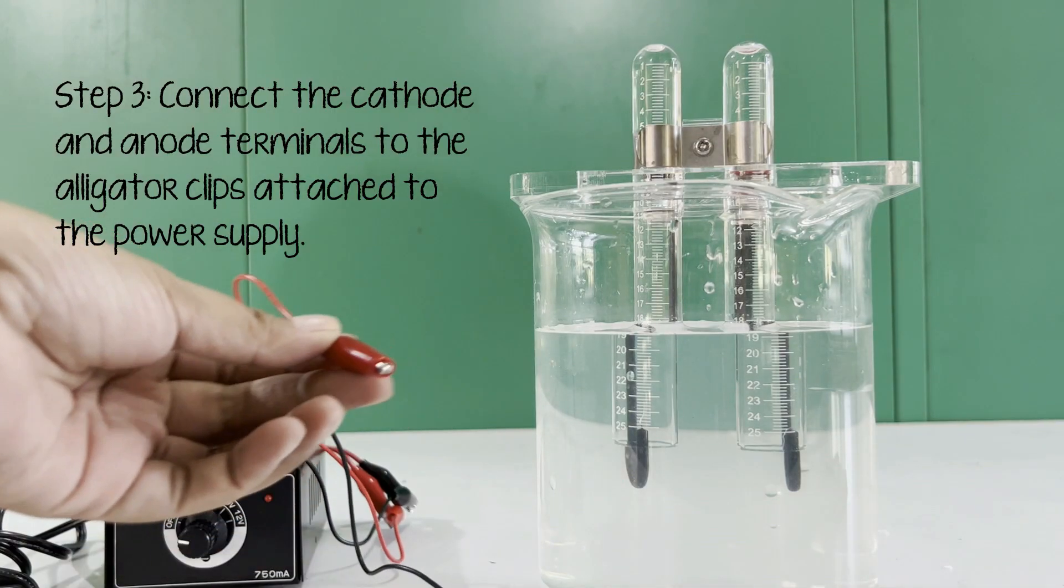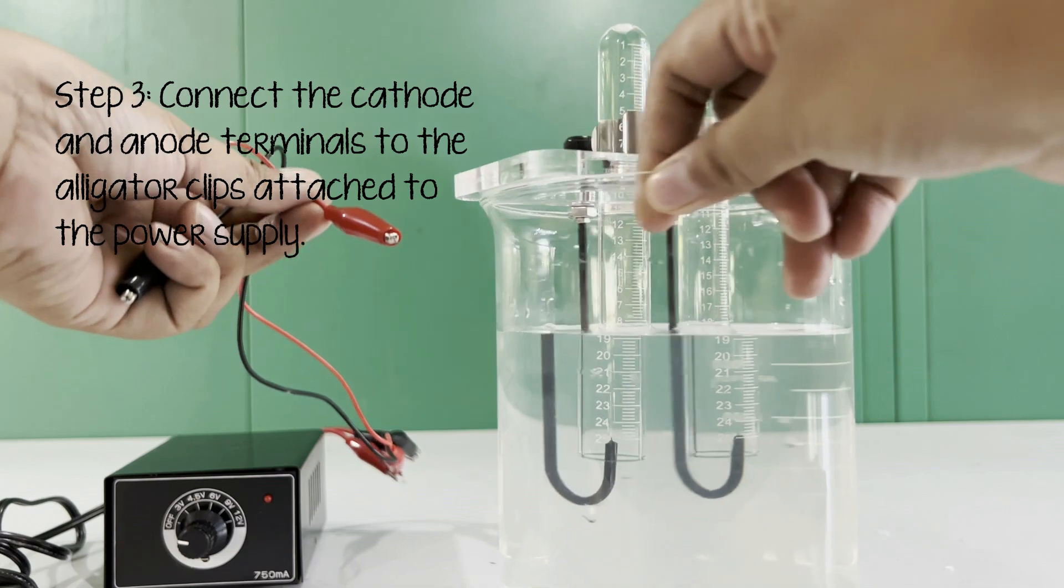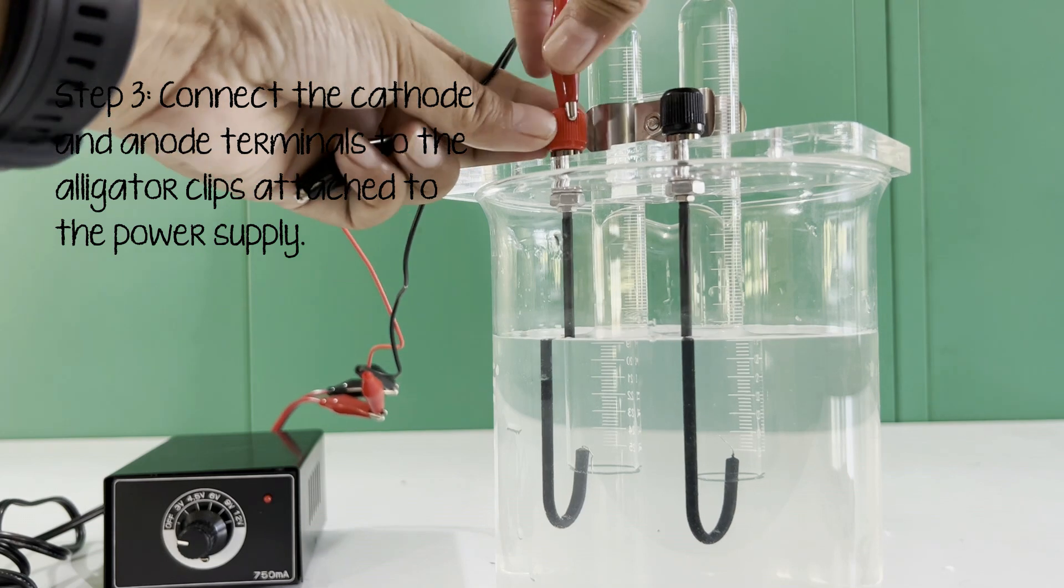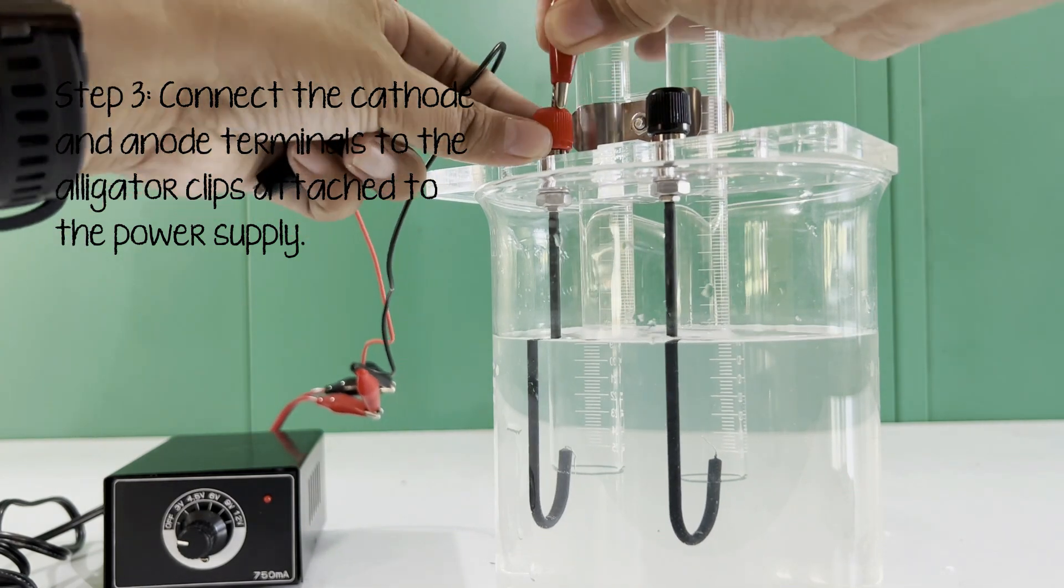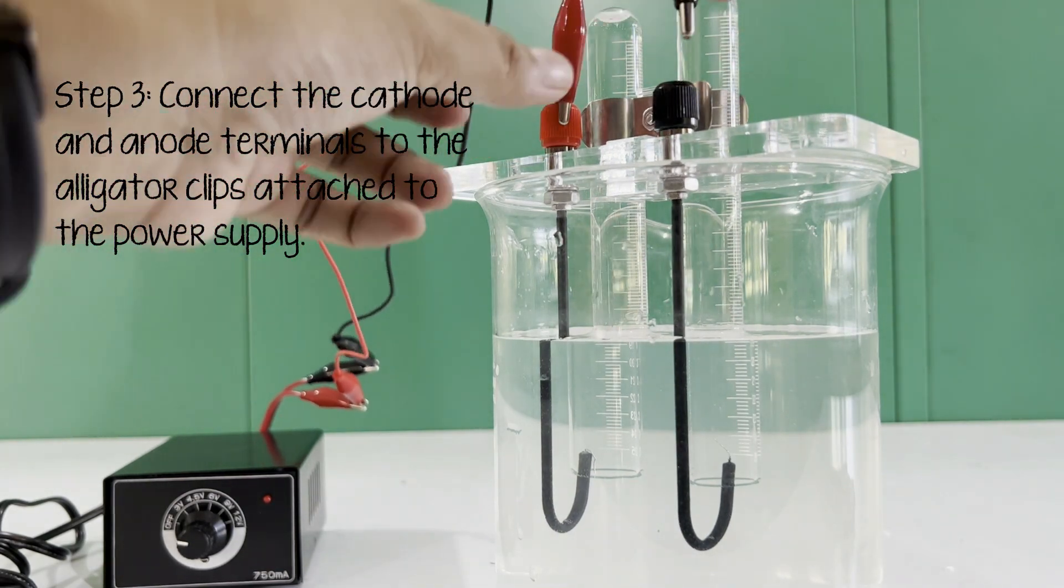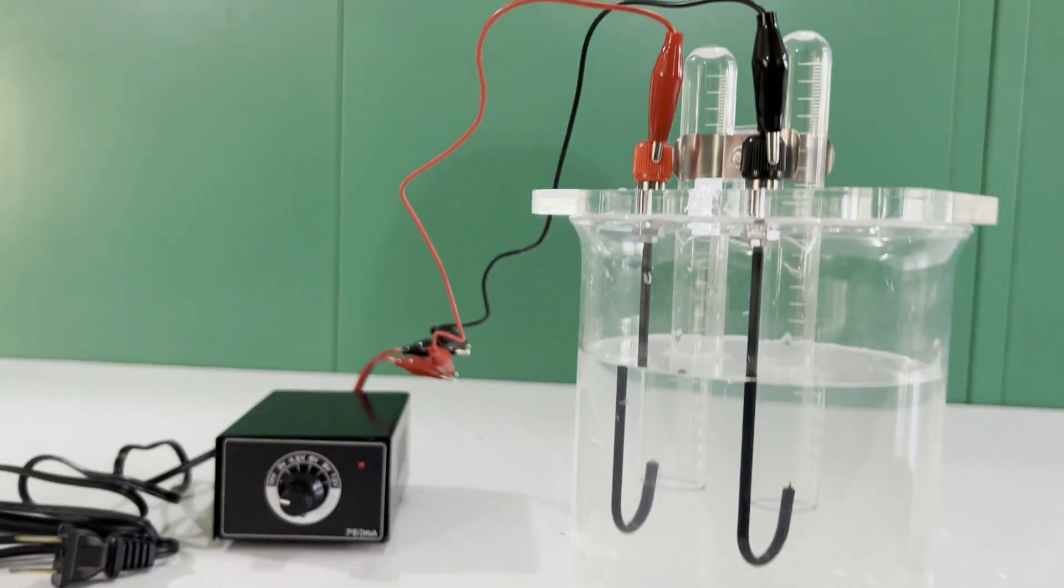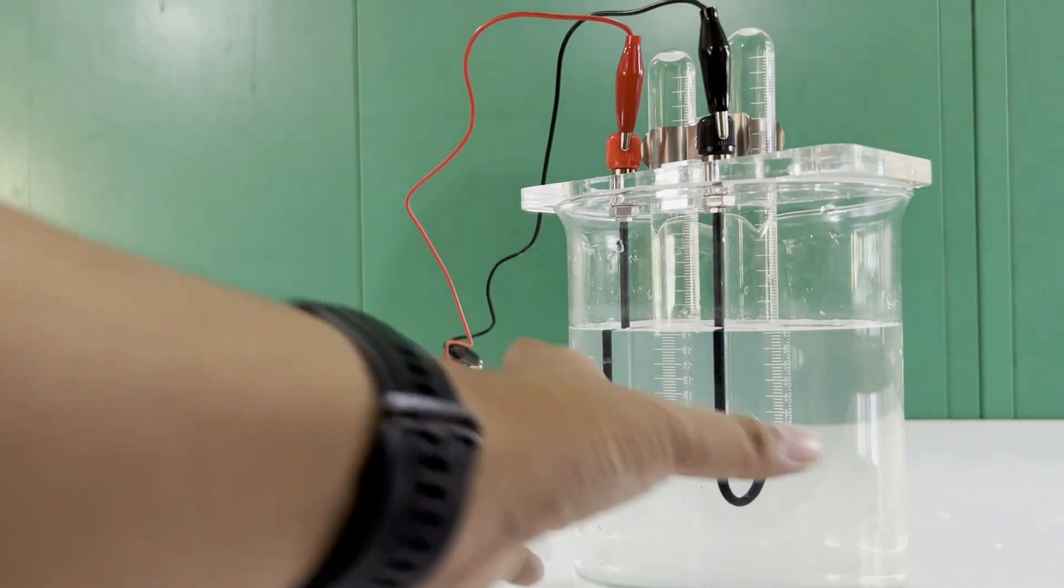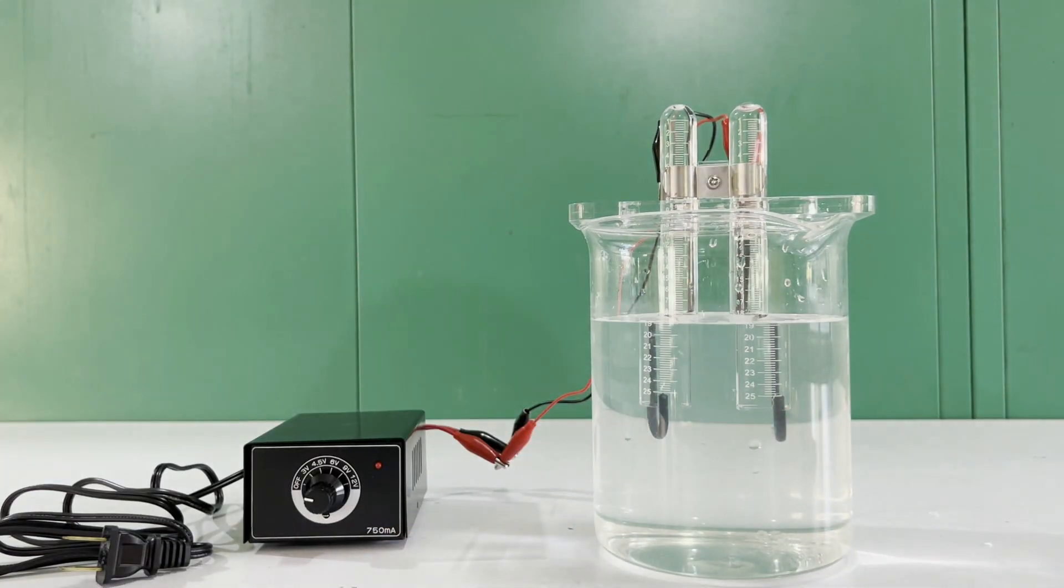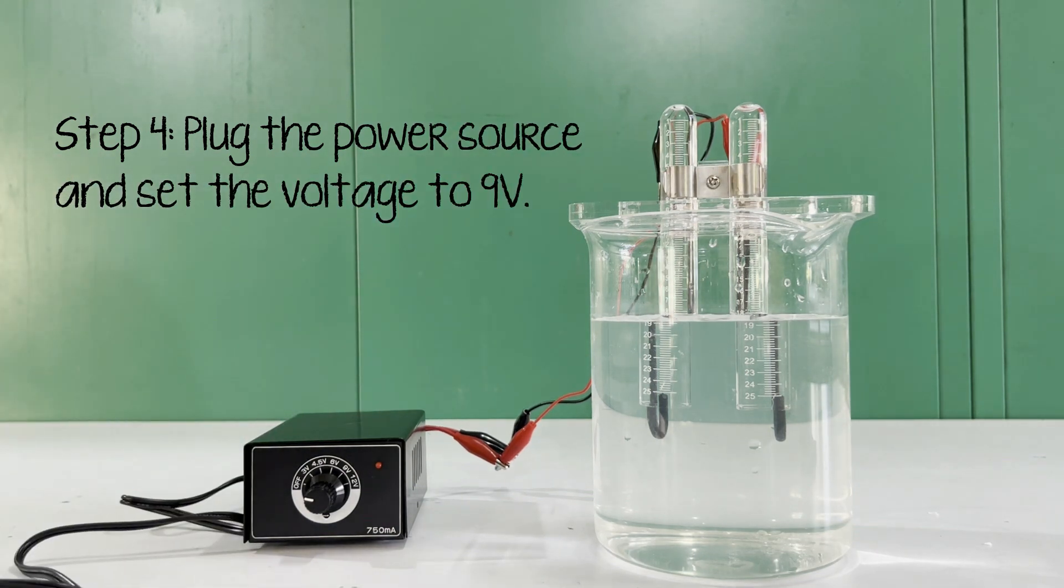Next, connect the cathode and anode terminals to the alligator clips attached to the power supply. Make sure that you are attaching to the correct colors. The cathode is the black terminal and is the negative electrode, while the red one is the anode and is the positive electrode. Plug the power source and set the voltage to 9V.